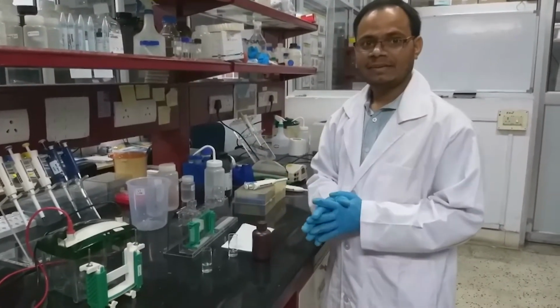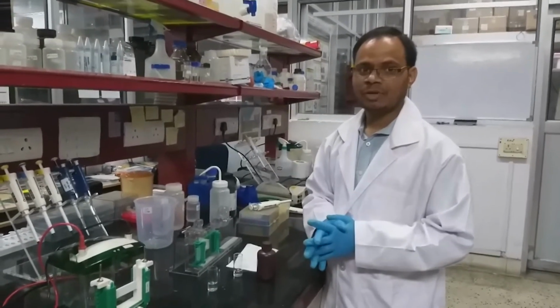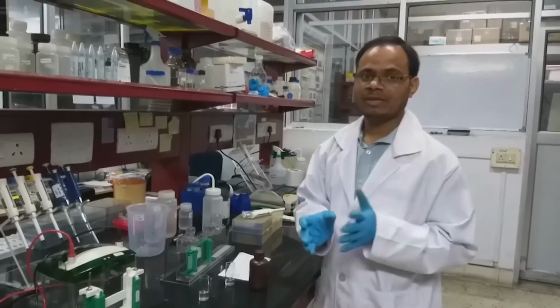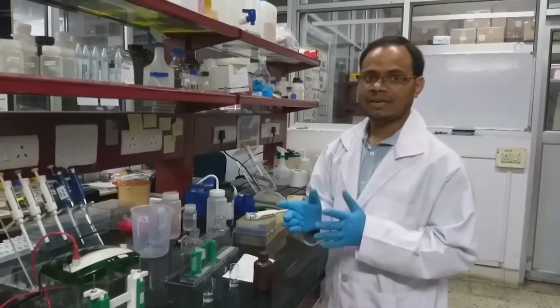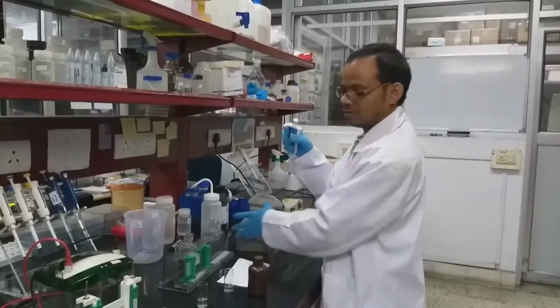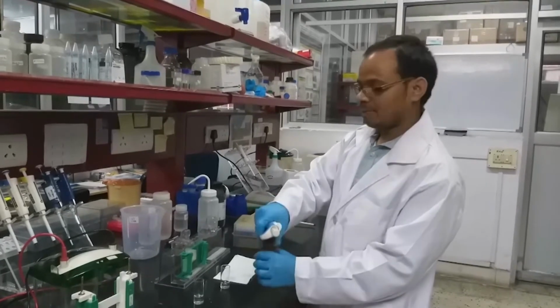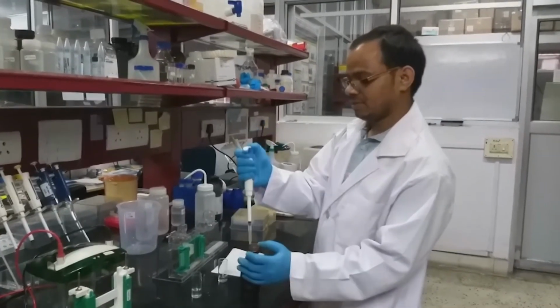Already in the introduction, I explained how much percentage we have to prepare and how much quantities of acrylamide and bisacrylamide need to be taken. So here we have to add 3.3 ml of acrylamide solution, 30%.